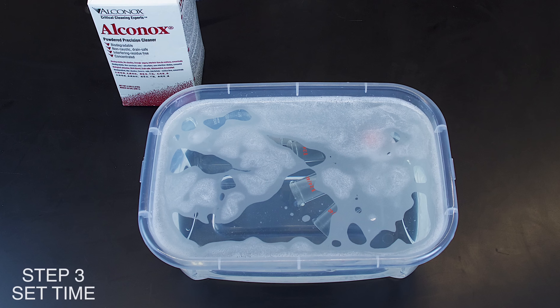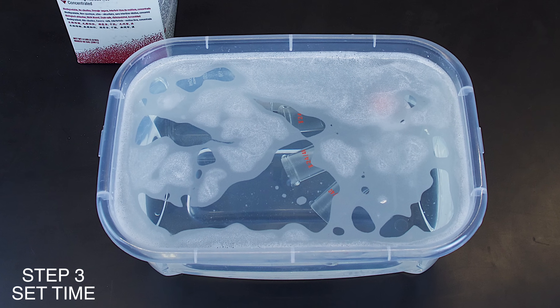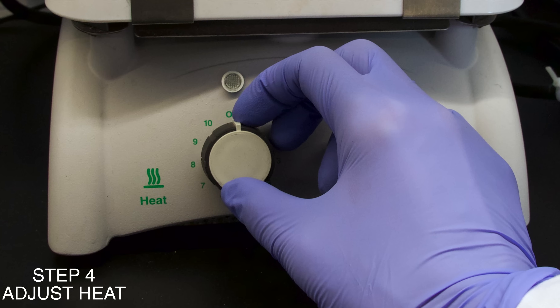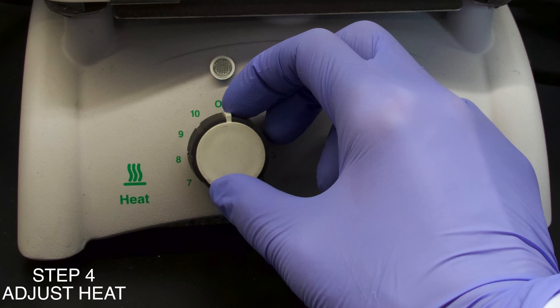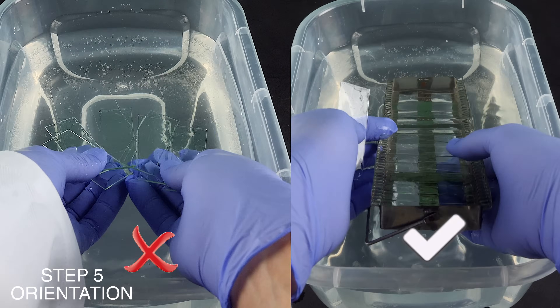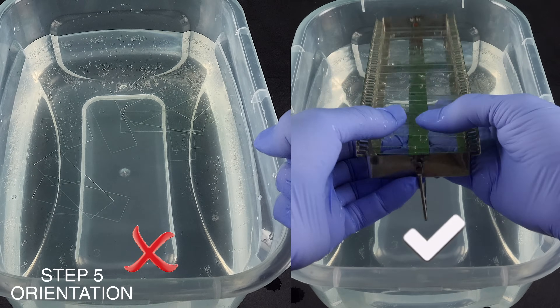The time set for cleaning is equally important — the longer the cleaning, the more available cleaning capacity is used. Don't forget to properly adjust the heat: every 10 degrees Celsius increases the cleaning temperature and doubles the cleaning speed. Proper orientation means that surfaces must be oriented to both the cleaning solution and rinsing water.